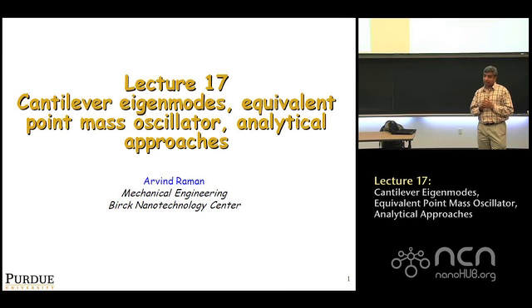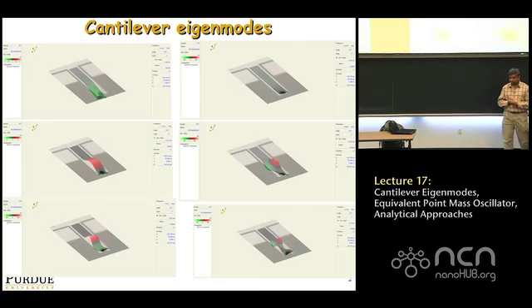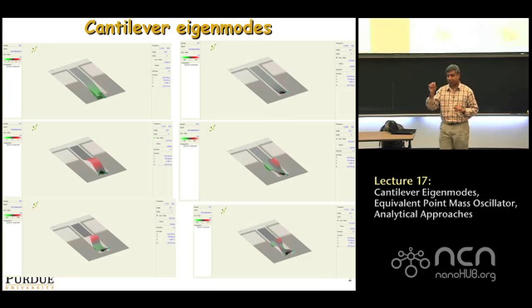We'll talk about an analytical approach today that is the basis for phase contrast imaging, okay? So we'll segue to analytical approaches, phase contrast. It's an extremely important lecture, and I hope you sink your teeth into it and really get to understand the details, okay? All right.